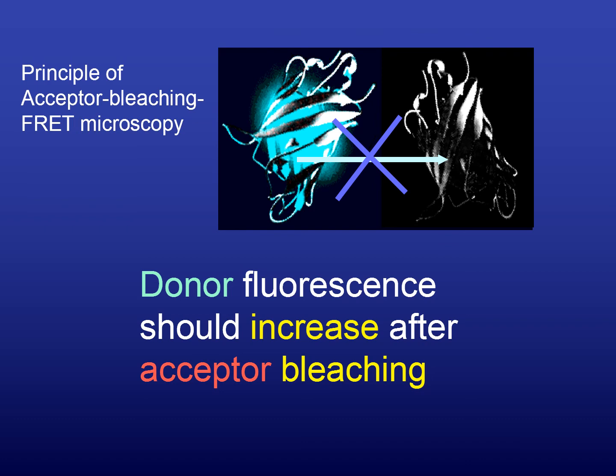So if you're looking at the acceptor and you're seeing it's not immediately responding to the light given to it, but it takes a little bit of time to first accept the light from the donor, then that's the best proof you can ever get, because it's really hard to explain any other effect than Förster transfer for getting you this slower rise of the initial signal. The problem with that is, of course, if your transfer efficiency is very high, it's very hard to detect this very short time of acceptor rise.